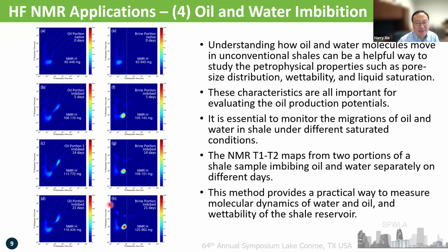At the same time, you can see originally there's nothing here, but you also see some water moved into there. So you're probably going to ask yourself, why is the water going there? It's not going there. Most likely, initially you have some water in this place. The water probably replaces some of the oil and makes more oil move to the region where it's supposed to be. So that's another example of NMR applications.